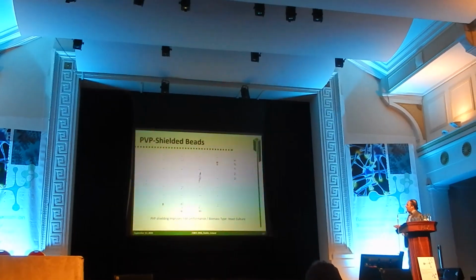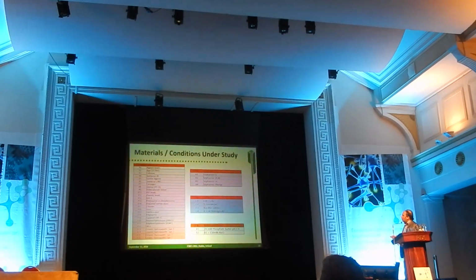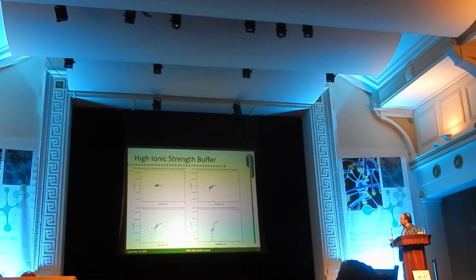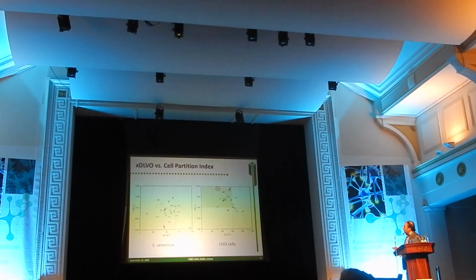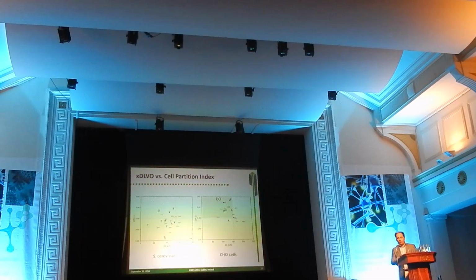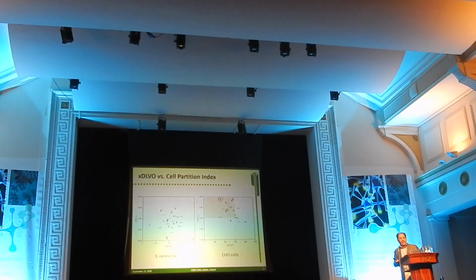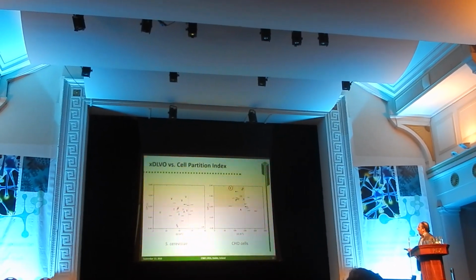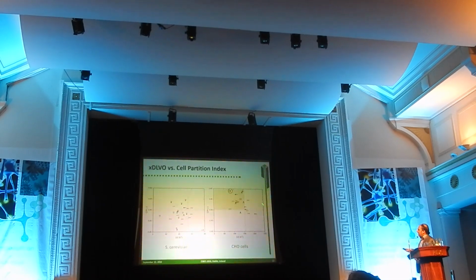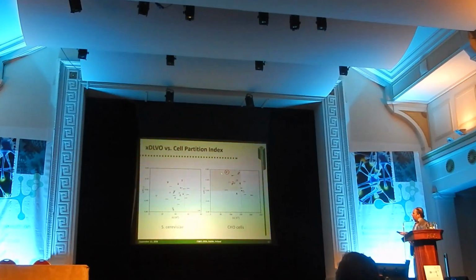So we are based on previous work by us, but I am going to show you just here something that we did, which is we screened for polymers for actually protecting protein A or mixed mode beads against cell adhesion. And this screening resulted in the diagram like this one that you see here, and a few polymer candidates are on top of the diagram.